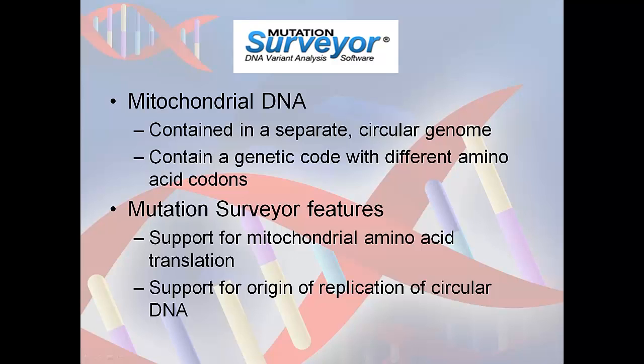Mutation Surveyor provides solutions to these issues by utilizing the annotation information within a mitochondrial GenBank file. This accounts for differences in amino acids as well as the origin of replication or D-loop of the circular sequence. By using the appropriate GenBank file, users can analyze mitochondrial sequence data in the same way as nuclear sequence data, taking full advantage of the features and reporting capabilities of Mutation Surveyor.